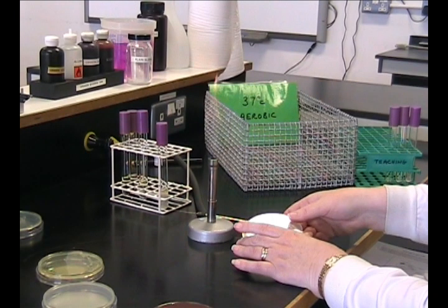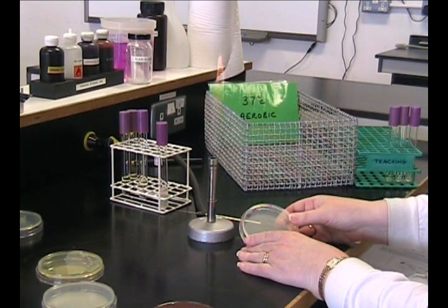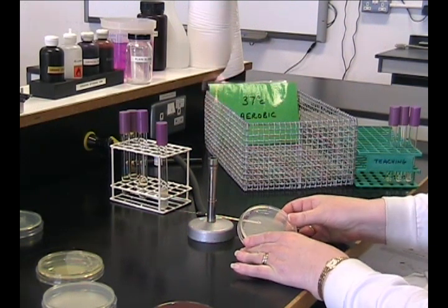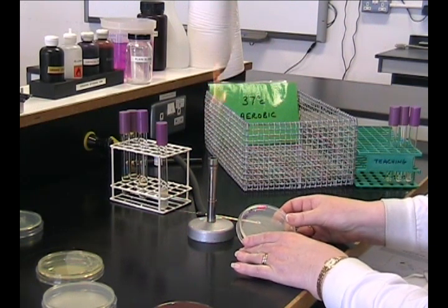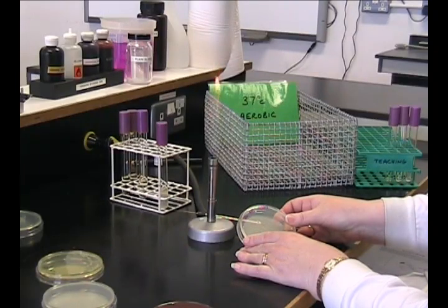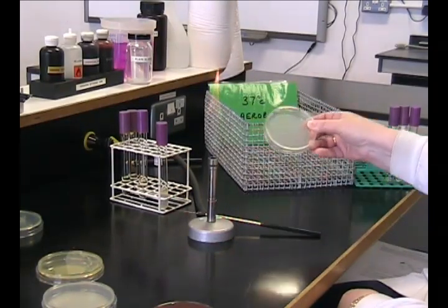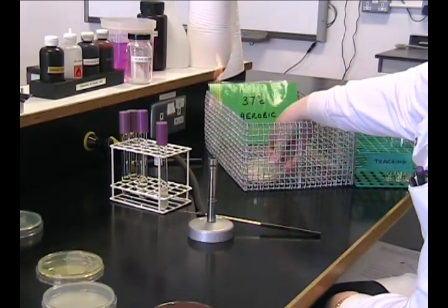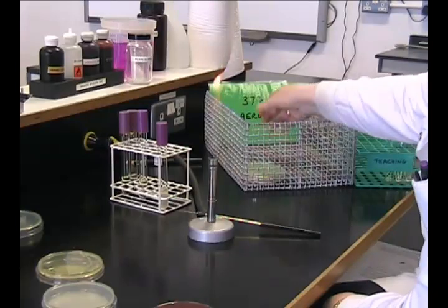When you've finished streaking your plate, it's important to label it with your initials, the type of media you've used and the date. This will enable you to find your plate in the next practical. Then place your plate ready for incubation inverted into the basket with the appropriate label and temperature.